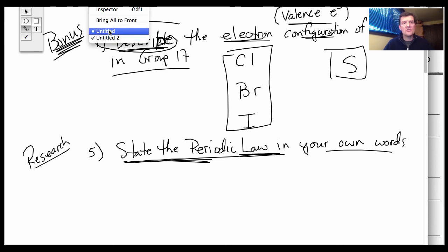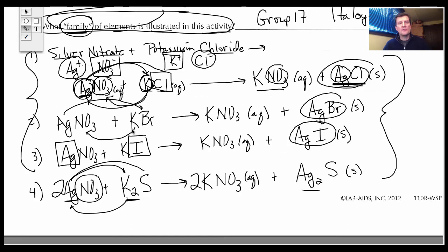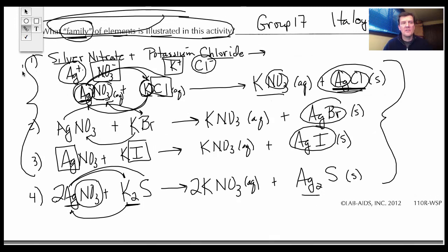In addition, you should have on your lab report, you should have these reactions written. Each of these reactions are showing you what's taking place for each of the combinations that we did in today's experiment.